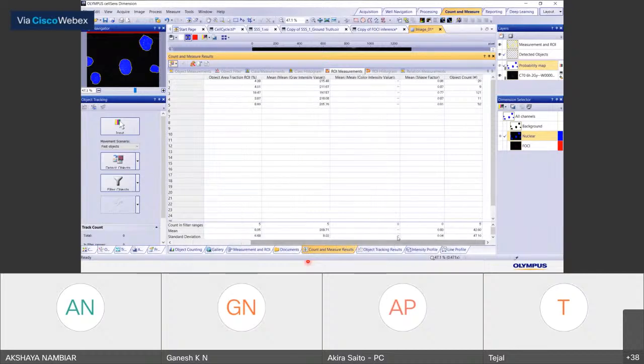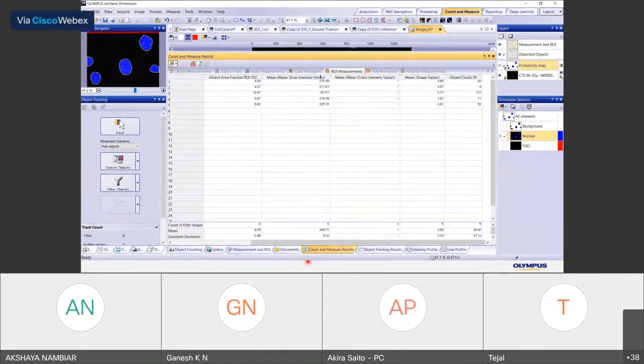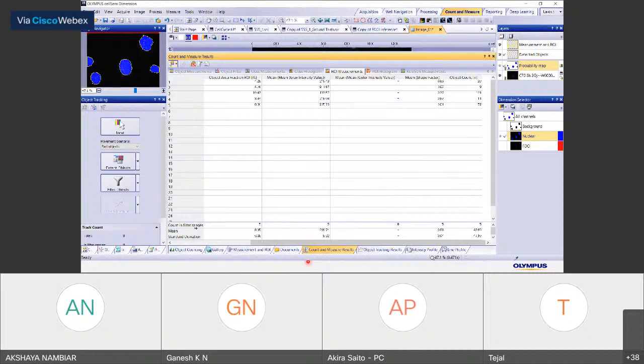And if you want the mean intensity information, you can find it from here. And also on the left you can find some statistics of all of the ROI information.